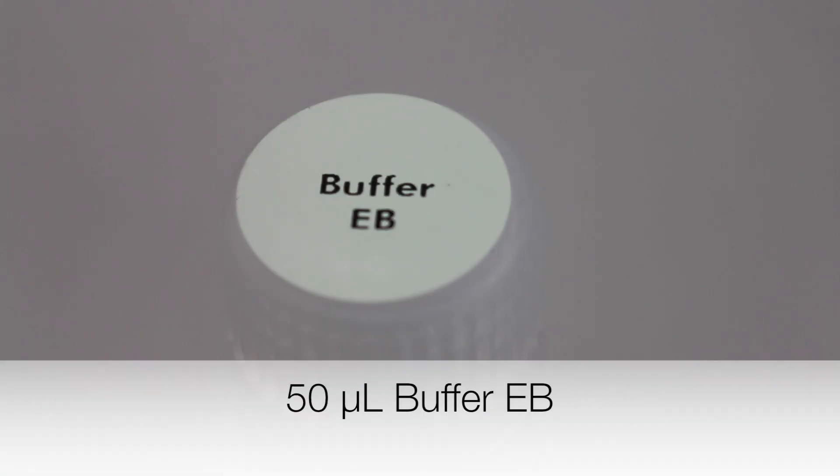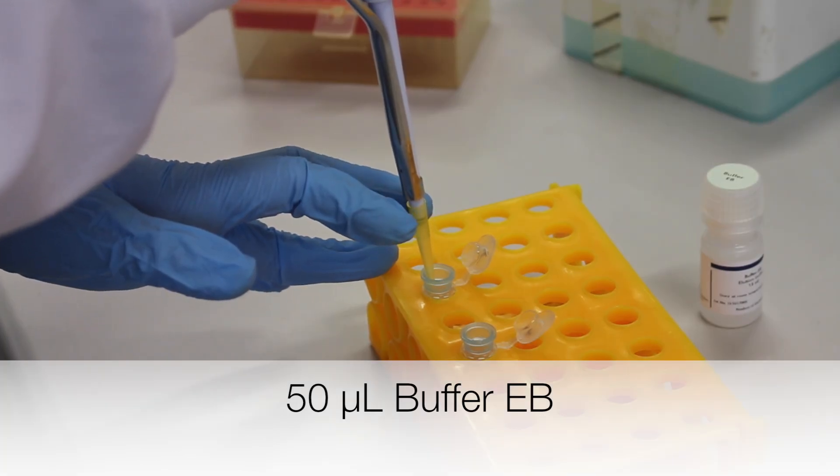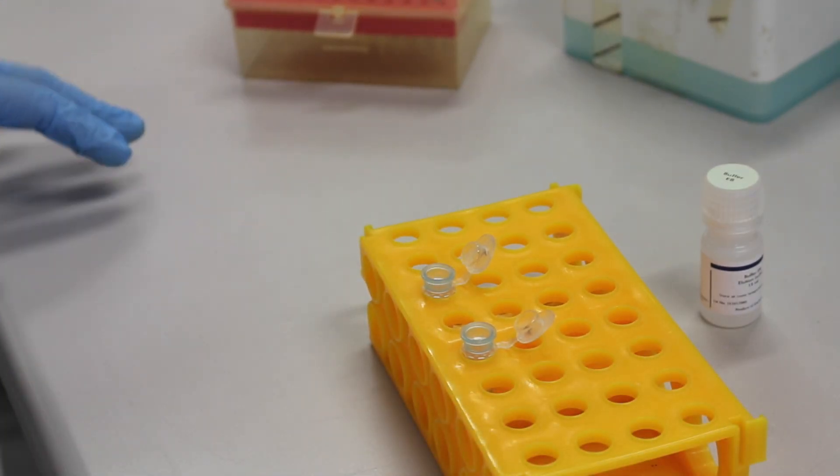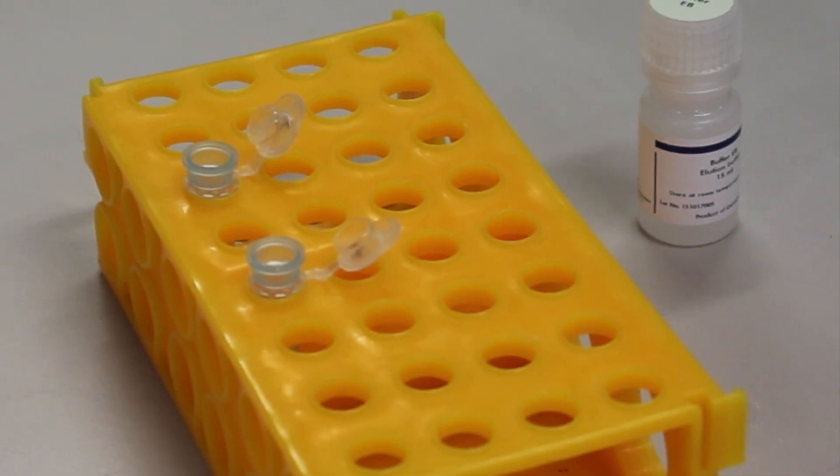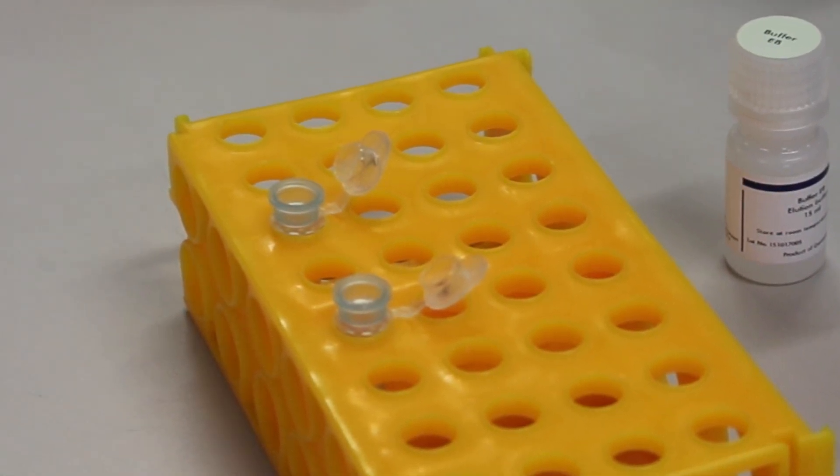50 microliters of buffer EB is added to the center of each column. This buffer elutes the plasmid DNA. The columns are left to stand at room temperature for 5 minutes.